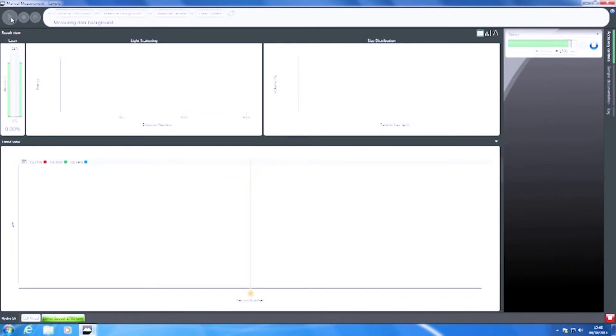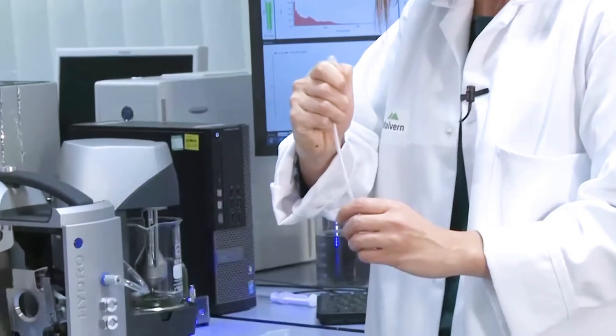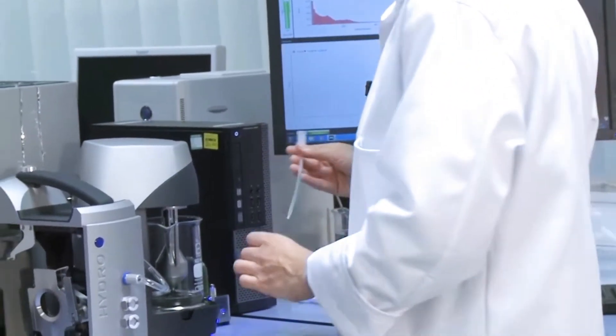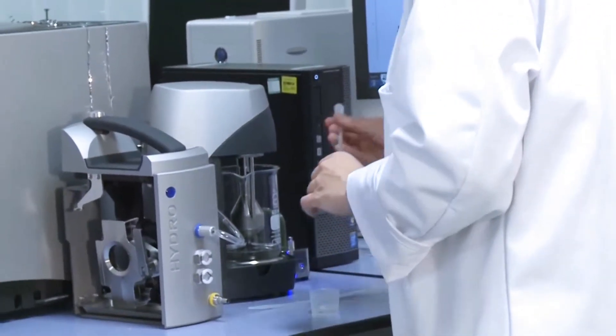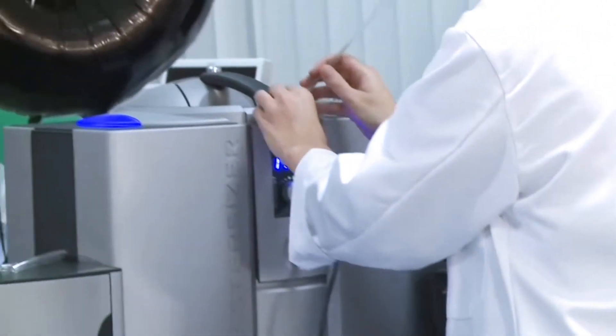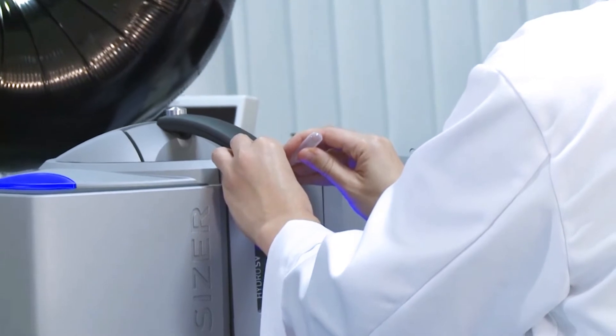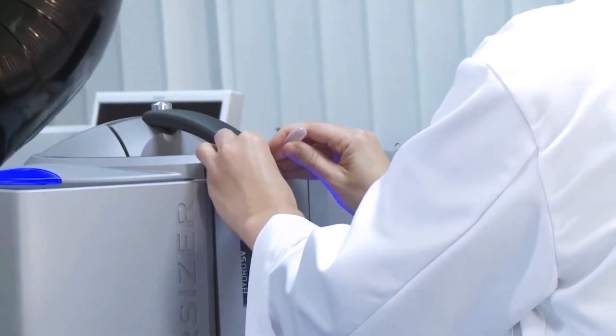So, I'm going to measure that background signal, and then just prepare some sample to measure. So, this sample we've just dispersed in water with a little bit of surfactant, and I'm going to drop that just down here.